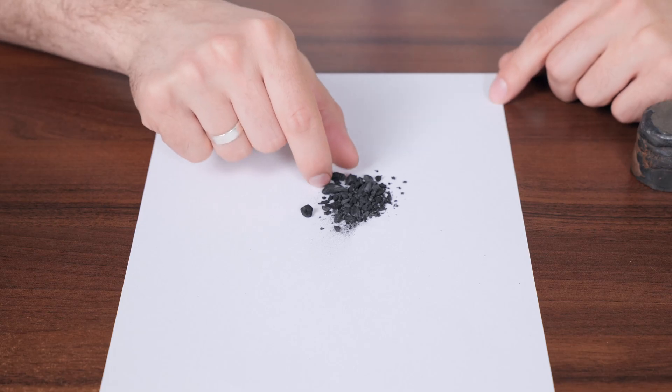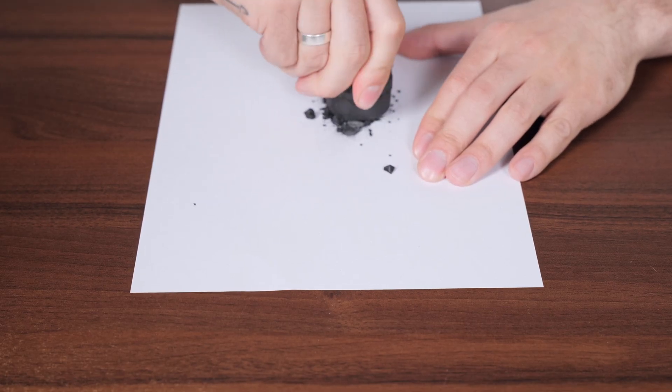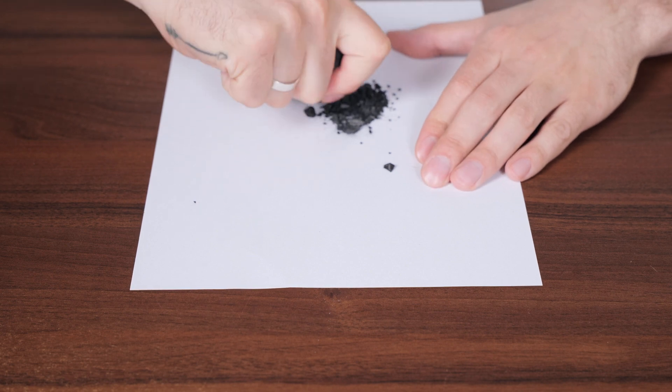The second step is grinding the sample. This is necessary to achieve a homogeneous mixture so the result represents the characteristics of the entire sample, not just individual grains. The finer the grains, the better the result. The optimal grain size is less than 75 micrometers.